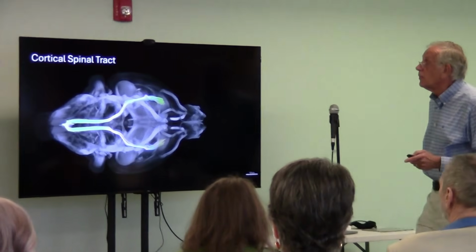How do you isolate the voxels, each voxel that you study, that you're trying to differentiate? You look at everybody. You have a ginormous computer that looks at all of them at the same time. I have more compute power than you can imagine. I have one computer that has 1,000 processors in it, and we'll see that in a minute. I'll get to that question. So you can do this sort of thing.